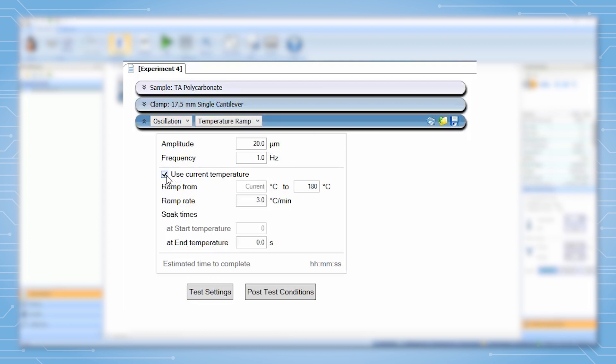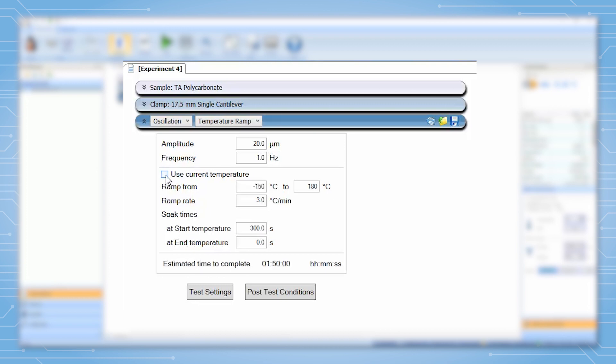For the temperature we set a start and end temperature. We can also set use current temperature to set the start temperature as the current temperature of the instrument. The ramp rate should be selected such that it does not change the result of the experiment.